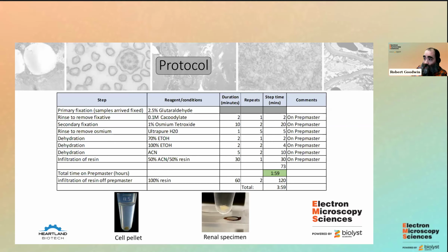But you can see on there, and some people I know are going to say, you only have it in osmium for 20 minutes. That can't be right. Yeah, it's 20 minutes instead of an hour, and you'll see from the photos I have at the end that everything comes out just fine. We did a lot of tinkering with times and really seeing where we can cut things down.